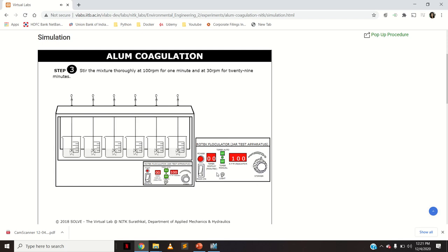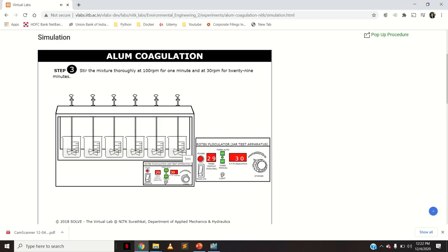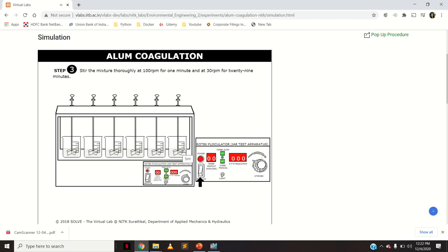After 1 minute, adjust the velocity to 30 rpm for another 29 minutes — this is slow mixing. This slow mixing is given for a larger time period so that the alum particles come close to the turbidity particles (colloidal impurities), form flocs together, and agglomerate. The alum particles and colloidal particles come close to each other and form flocs during this slow mixing phase.